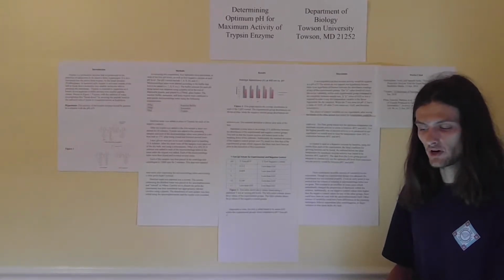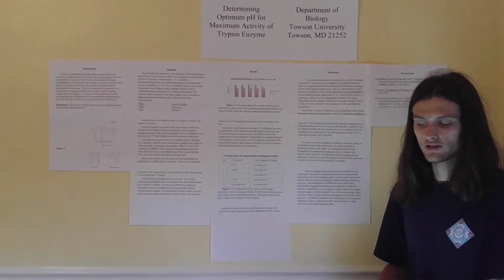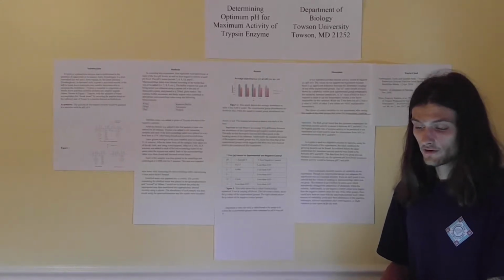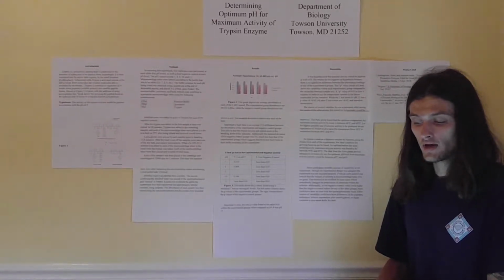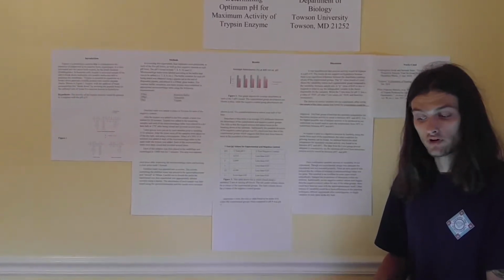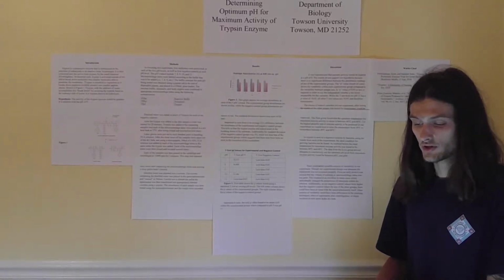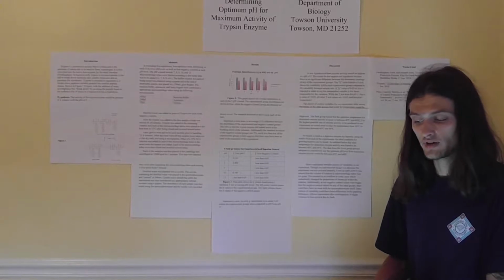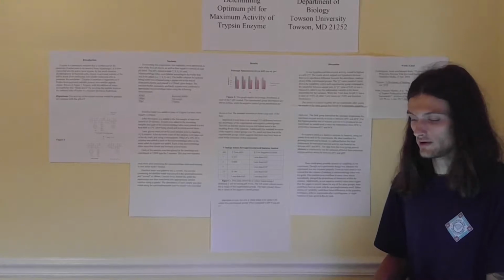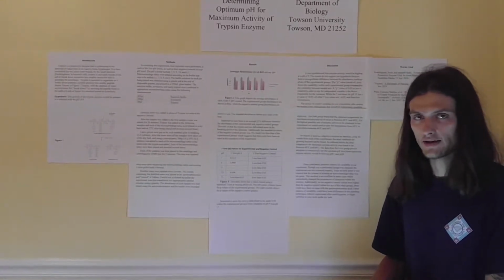In executing this experiment, 4 replicates were performed at each of the 5 pH levels, as well as 4 negative controls at each pH level. The negative controls were necessary as they show if there is any non-enzymatic breakdown of the substrate. Though 3 replicates is the minimum number required to identify any potential outliers, 4 replicates were executed to obtain a more accurate average and a more accurate measure of variability. The pHs tested include 7, 8, 9, 10, and 11.